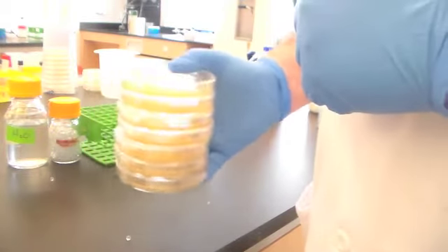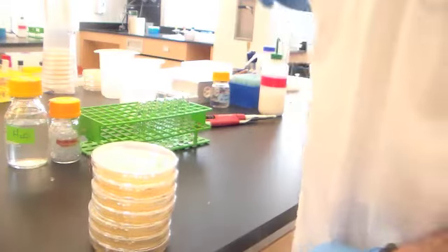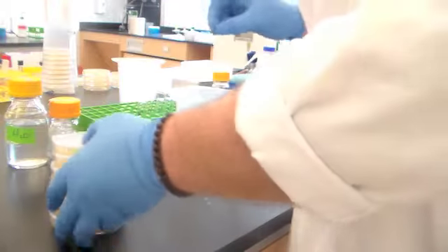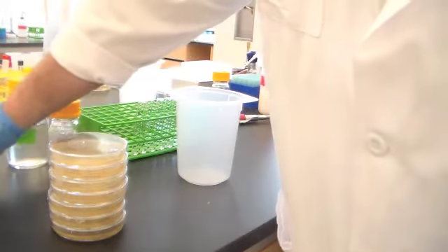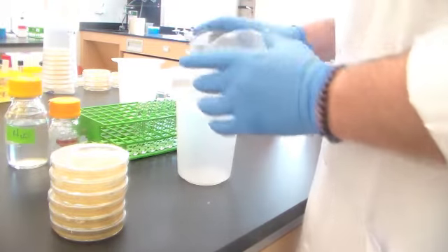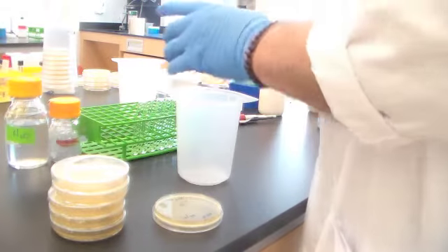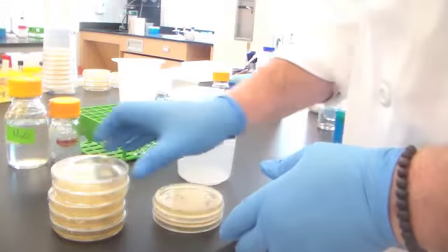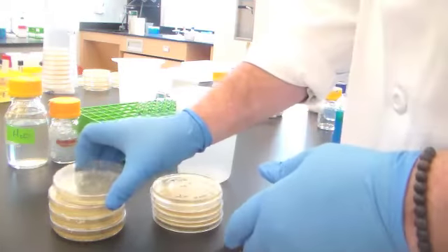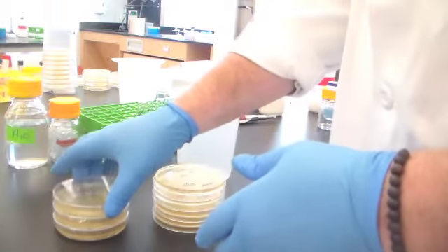Do that for 15 or 20 seconds until you're pretty sure that you've got those bacteria randomly distributed across that plate. Now, these are those little beads that escaped me. I'm going to put them in here because this is where I'm going to add all of these contaminated beads. We're going to put alcohol in. You'll actually be dumping yours into an alcohol vat to disinfect beads that will eventually get cleaned and autoclaved thanks to the hard work of your TAs.